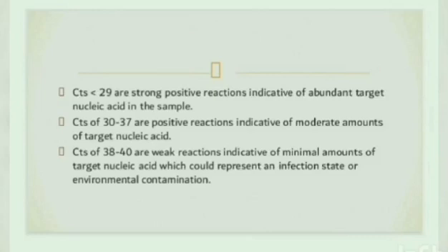CTs of 30 to 37 are positive reactions indicative of moderate amounts of target nucleic acid. CTs of 38 to 40 are weak reactions indicative of minimal amounts of target nucleic acid, which could represent an infection state or environmental contamination.